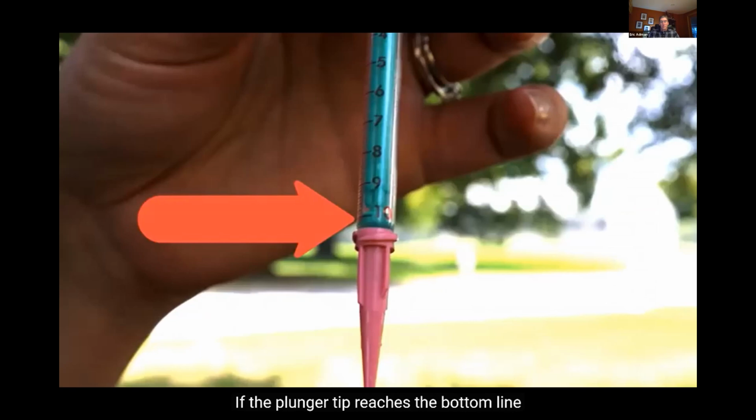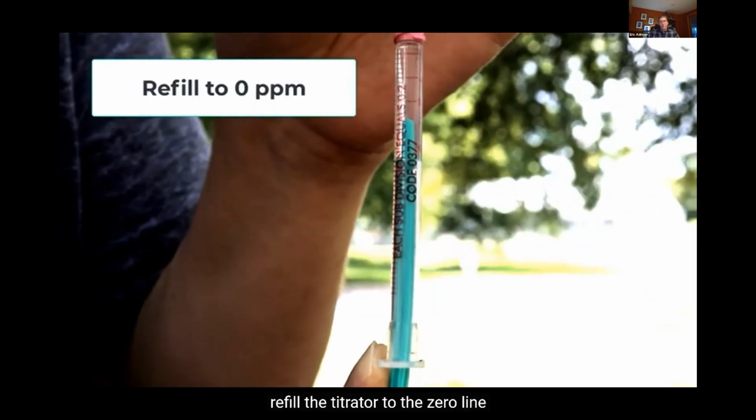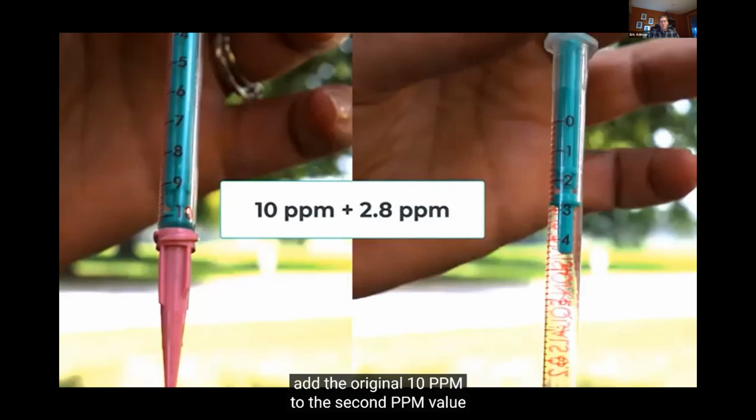If the plunger tip reaches the bottom line on the titrator scale, or 10 ppm, before you have reached the titration endpoint, refill the titrator to the 0 line with additional sodium thiosulfate and continue the titration. To determine the oxygen concentration, add the original 10 ppm to the second ppm value and record the total value.